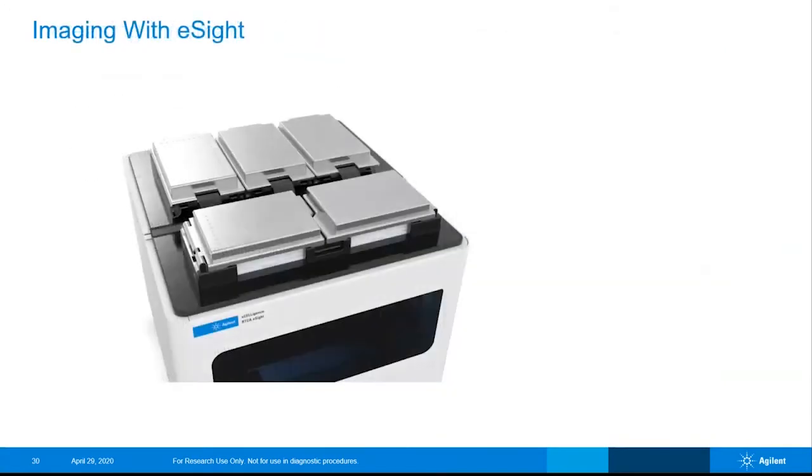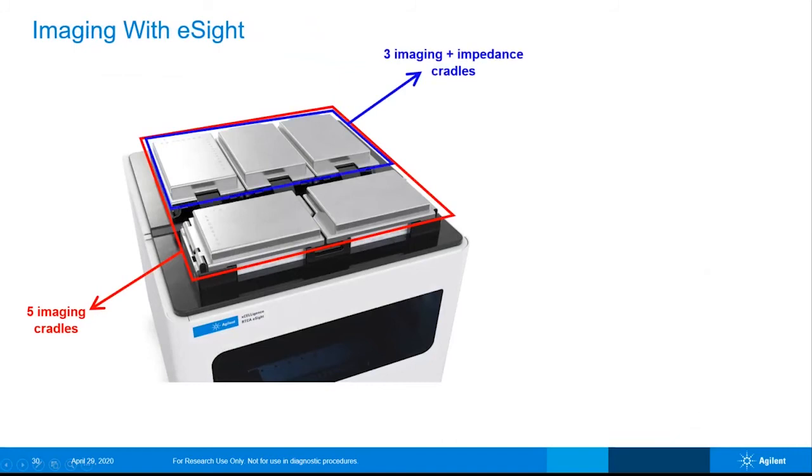This is a view of the top of the instrument. You'll see 5 cradles here. All 5 of these are capable of doing imaging, and the 3 in the back do both imaging and impedance. The instrument can scan impedance in these different cradles independently of one another, so you don't need to try and coordinate with what your colleagues are doing at any given time.